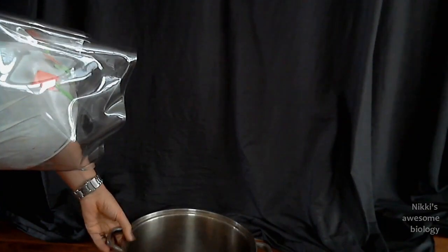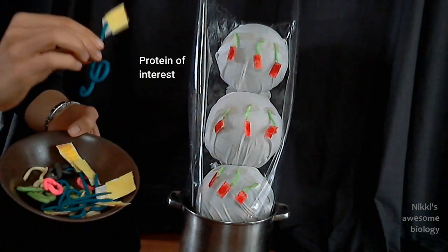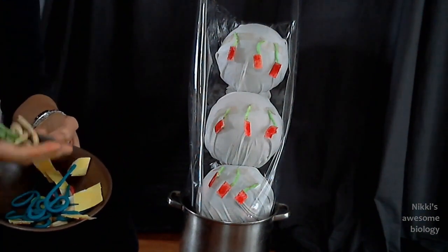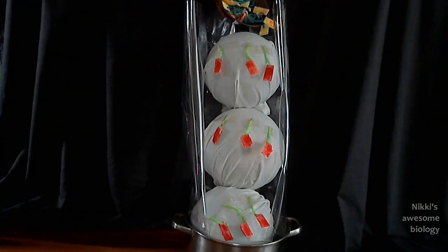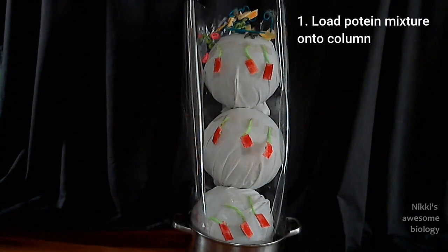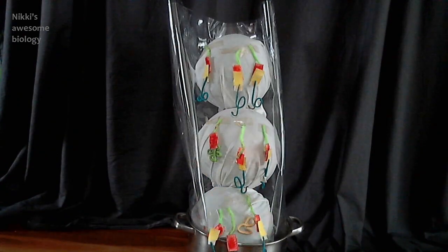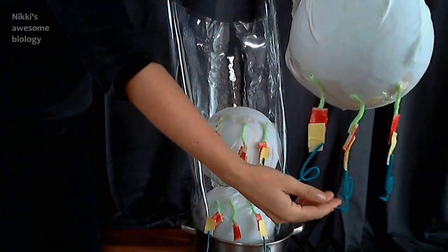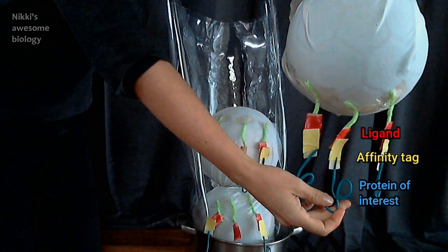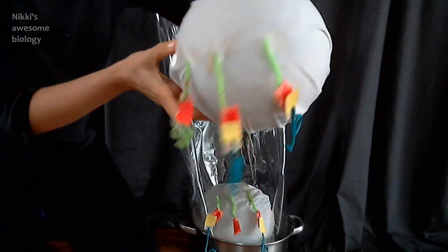To show what's going on inside, here's an open column containing many thousands of beads — represented here with just three soccer balls. The whole column is placed into something that can catch whatever's coming out. You load your whole protein mixture — which has your affinity-tagged protein of interest but also all the other junk from the bacteria, the non-specific proteins — onto the top of the column, and then through gravity, a pump, or a centrifuge, that whole material passes over those beads. If we take one of those beads out, we can see the daisy chain: protein of interest attached to its affinity tag, bound to the ligand, which is bound at the spacer attached to the bead.